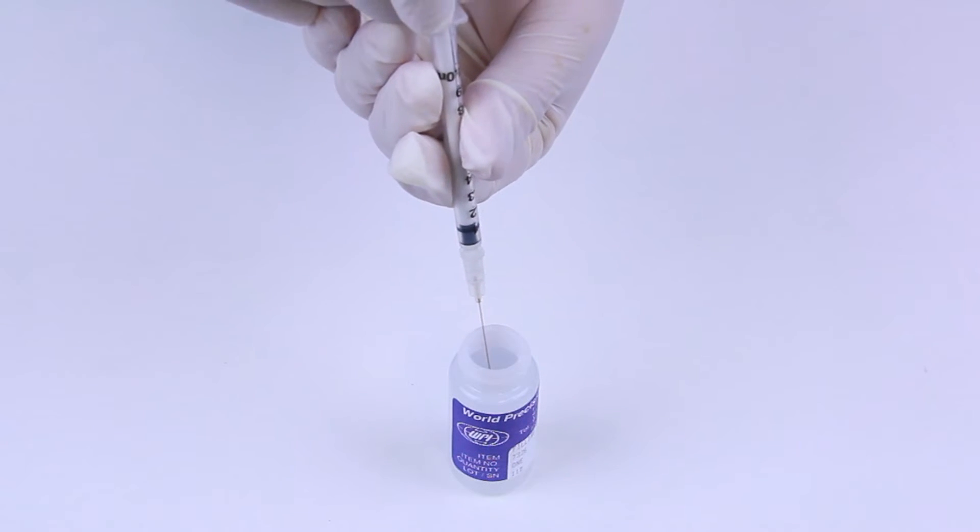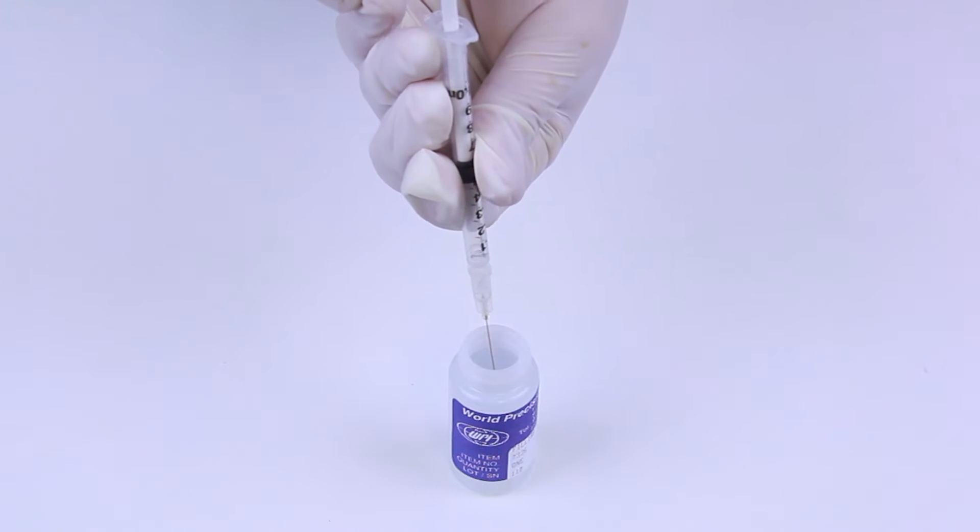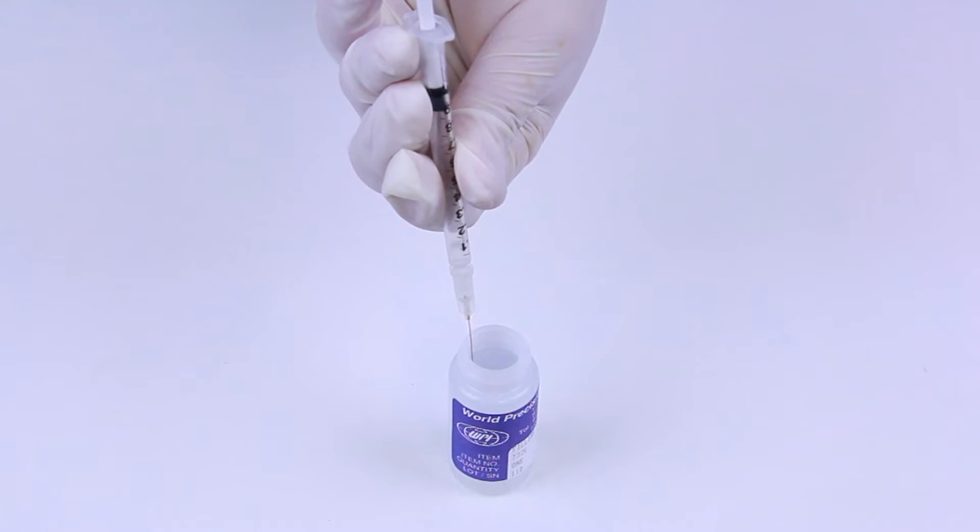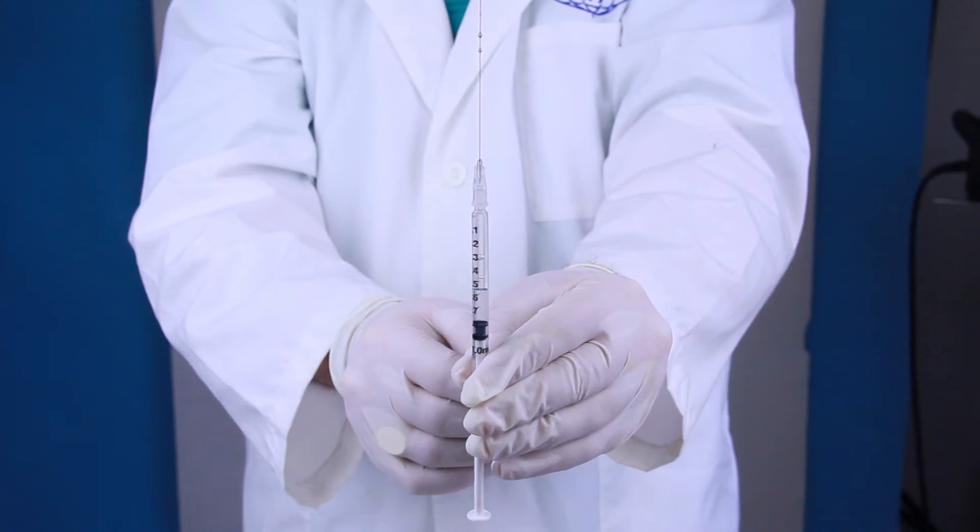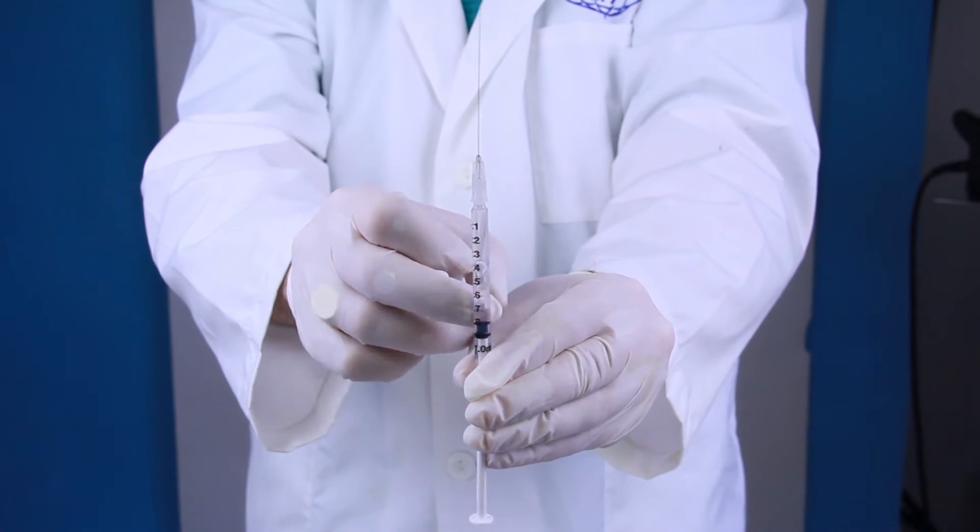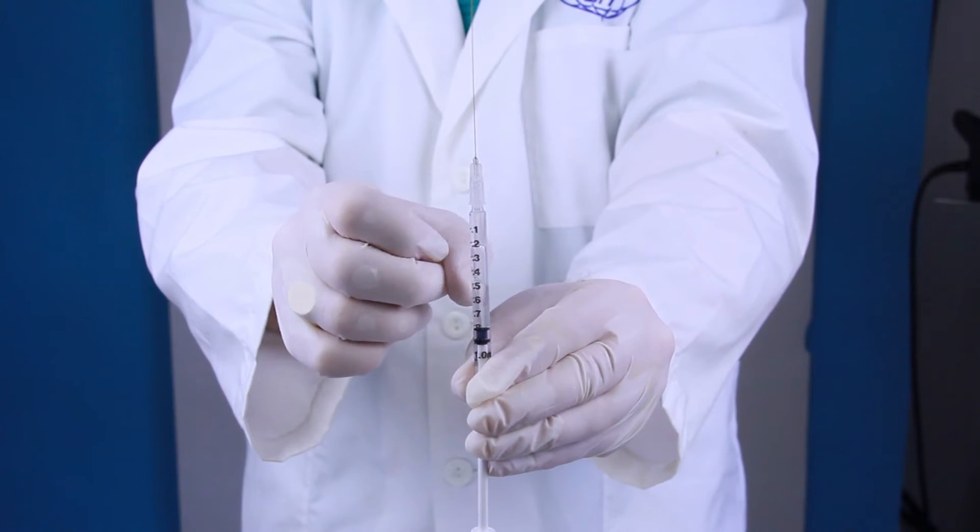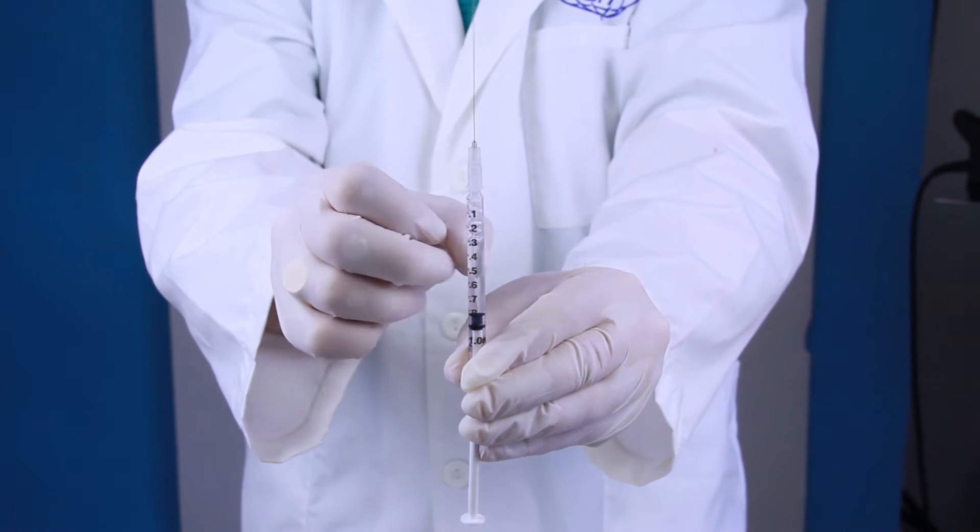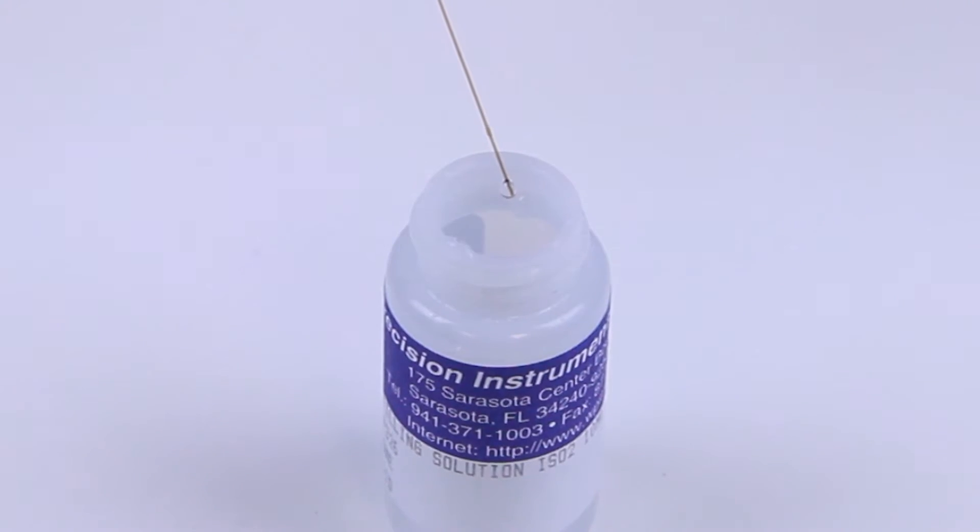Draw up a small volume of solution, about one milliliter, enough to fill the sleeve. Tap the syringe to shake loose any trapped air bubbles and move them upward. Then eject a few drops of fluid to make sure any bubbles are expelled.